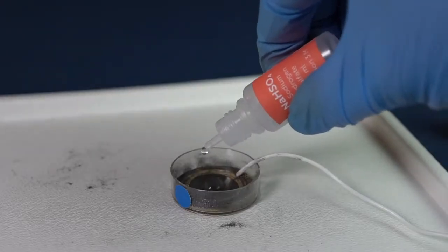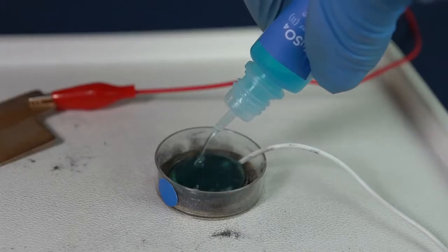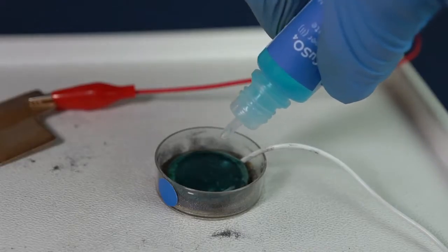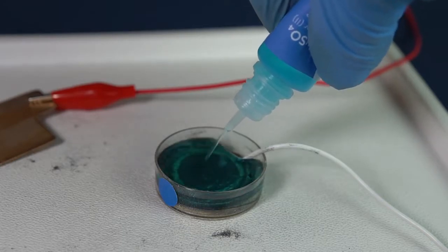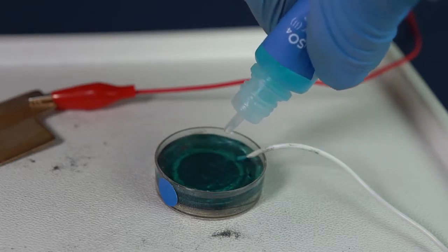In the Petri dish, pour in a whole bottle of copper sulfate and sodium hydrogen sulfate solution, which is the electrolyte. Then the solution will be able to conduct electricity and transfer copper ions.